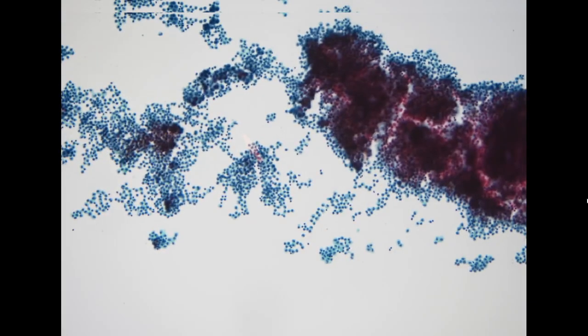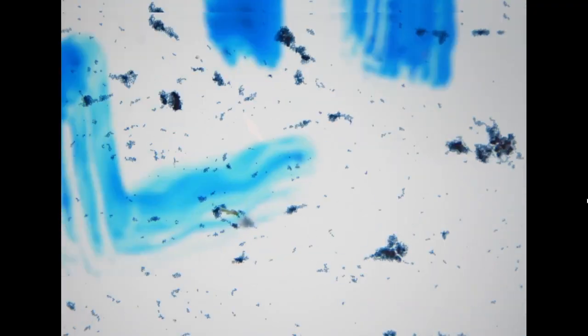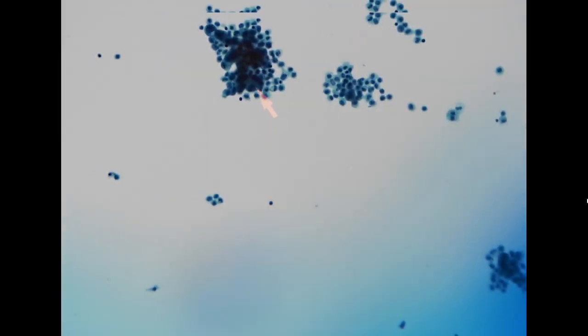For this specimen, we did a cytospin preparation. Apparently the specimen itself has a lot of cells. When we do the cytospin, we try to smear the specimen as a flattened monolayer sheet. In this specimen it was a little bit sticky, so the smearing was not very successful. Hence, we do not appreciate these cell clusters as nicely as they should be demonstrated. However, we also have a cell block preparation.